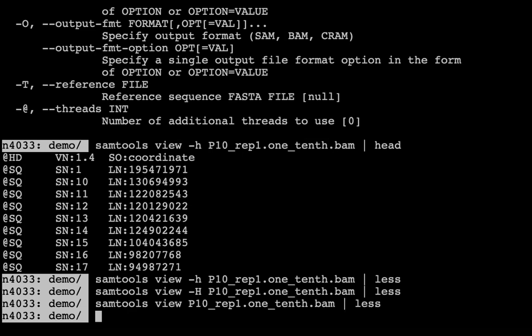Okay, align with those. This is here what is... And then okay, they do generate. You know how to do this? Align if you have like specific questions.